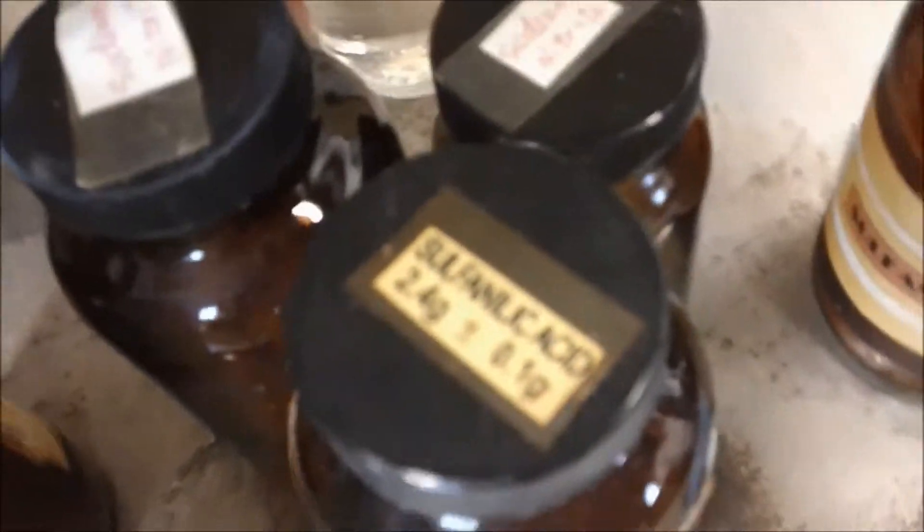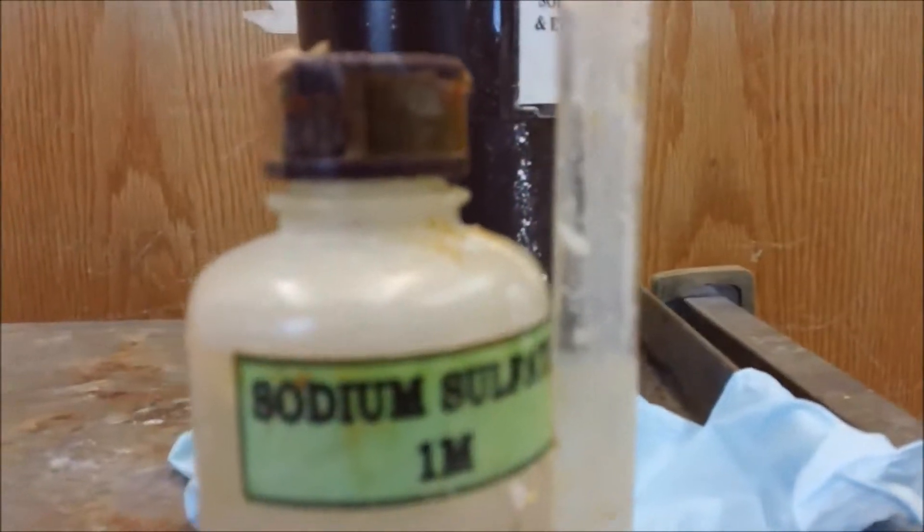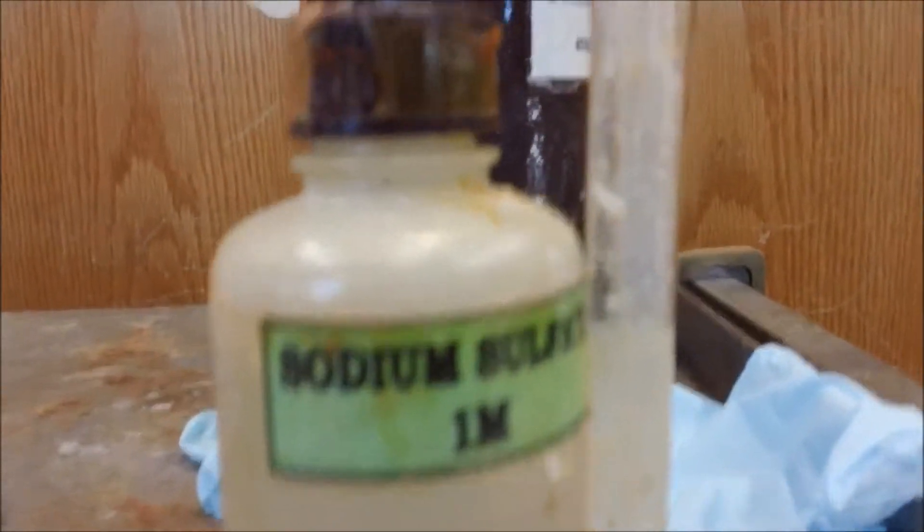And this is the sodium sulfate, which is going to add 1.5 milliliters of this.